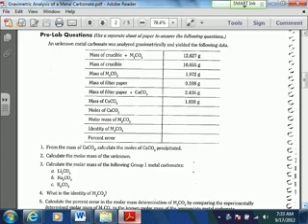You don't want it to be a metal carbonate with 5H2O or something like that, okay? That can mess up your experiment. So we want to make sure that it's not like that. So once you dry it out, then you've got a mass of 1.972, okay? Once you subtract those two numbers from one another. So that's the original mass of the unknown, okay?